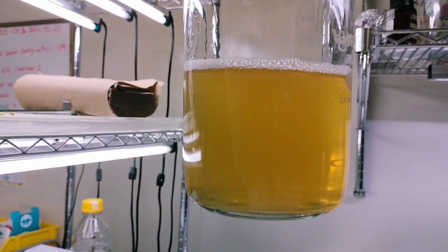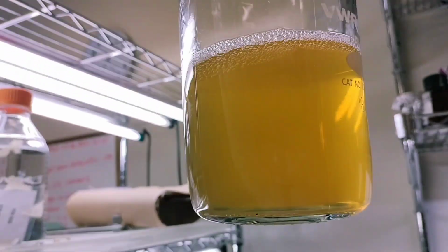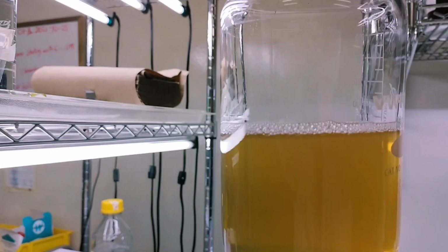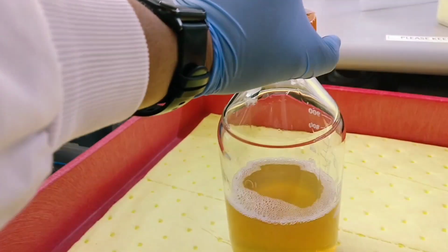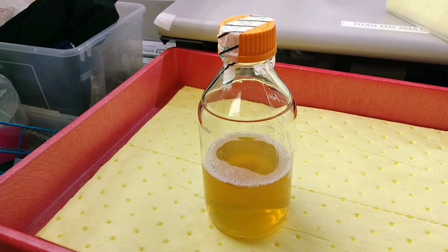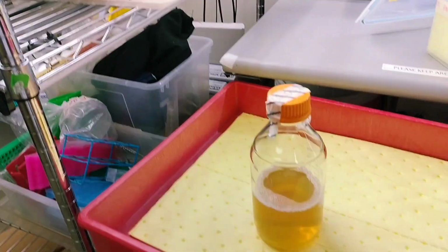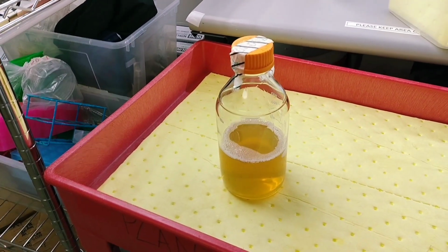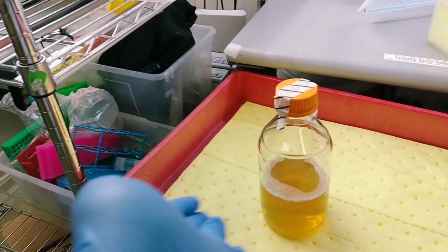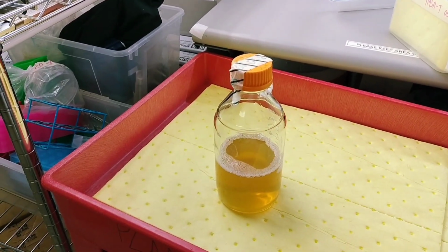The agar didn't dissolve quite well, just some solidification at the bottom, but that's fine. It is hot, so I'm going to spray it down with 70% ethanol before I put it in the BSC, and I let it cool for a bit, like how you do the baby bottle. You test it against your inner wrist, and once it's warm to touch, then I'll pour.